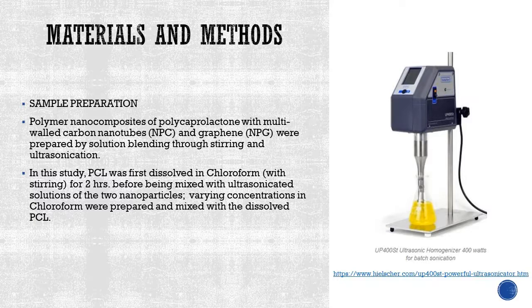After the solutions were prepared, the PCL and PCL plus nanoparticle solutions were placed on glass molds into a glass vat for evaporation of the solvent, creating thin film membrane samples for different characterizations.